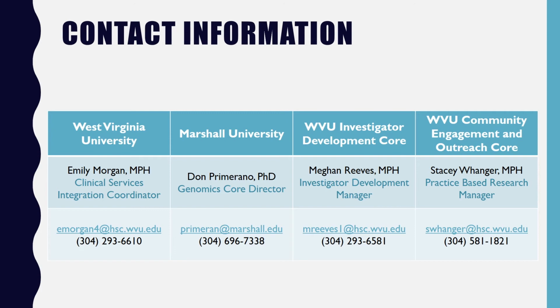I've included some contact information for the implementation at West Virginia University and at Marshall University, and also for some core managers who can help you with some core-specific questions. But of course, if you have any questions, feel free to email me and I'll point you in the right direction.